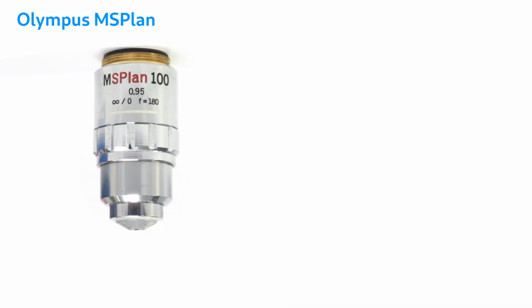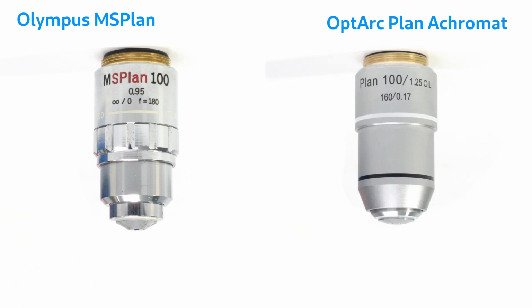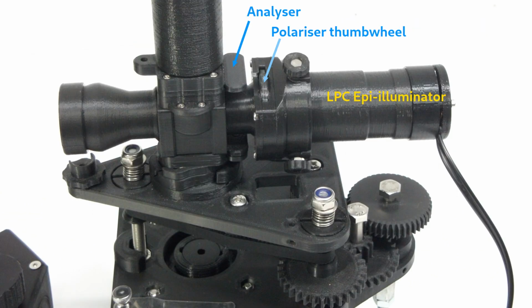This microscope uses Infinity Olympus MS Plan objectives and Olympus eyepieces, but PUMA will be using the standard Optarc finite tube length 160 mm planachromat objectives of the kind used for ordinary transillumination microscopy, as well as the standard Optarc eyepieces. The PUMA configuration uses the white light LED illuminator, and this time the illuminator is fitted to the Epi-illumination port with the polarizing connector.